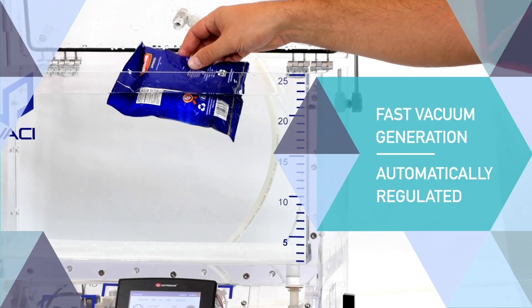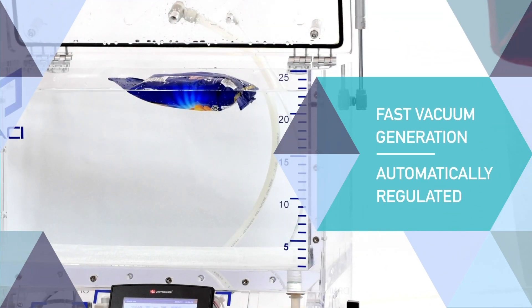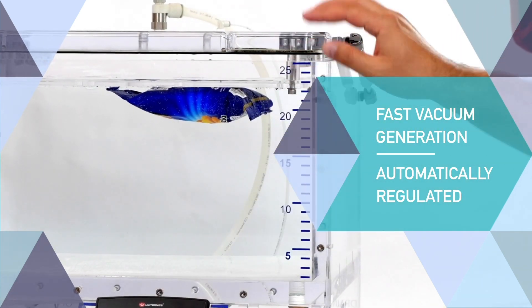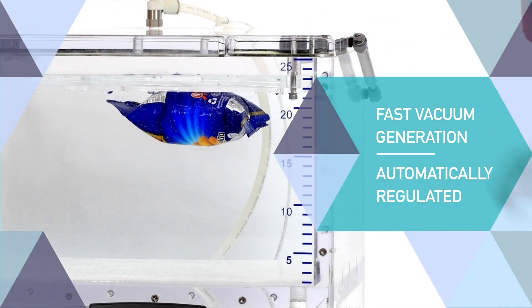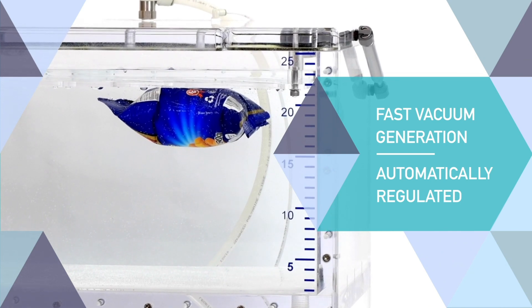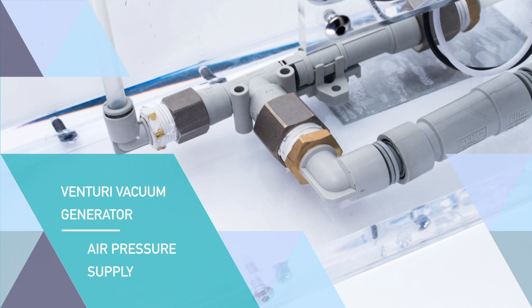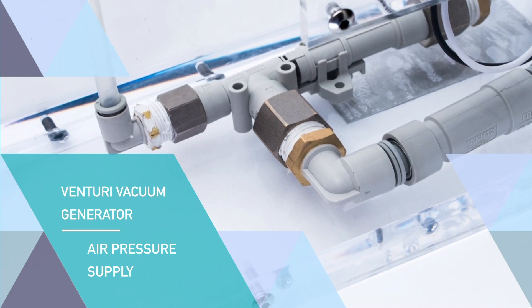Samples are placed inside the CDV leak tester by the operator and vacuum is automatically generated in a short time. It is regulated by a high precision manometer. The Venturi vacuum generator only requires an air pressure supply.